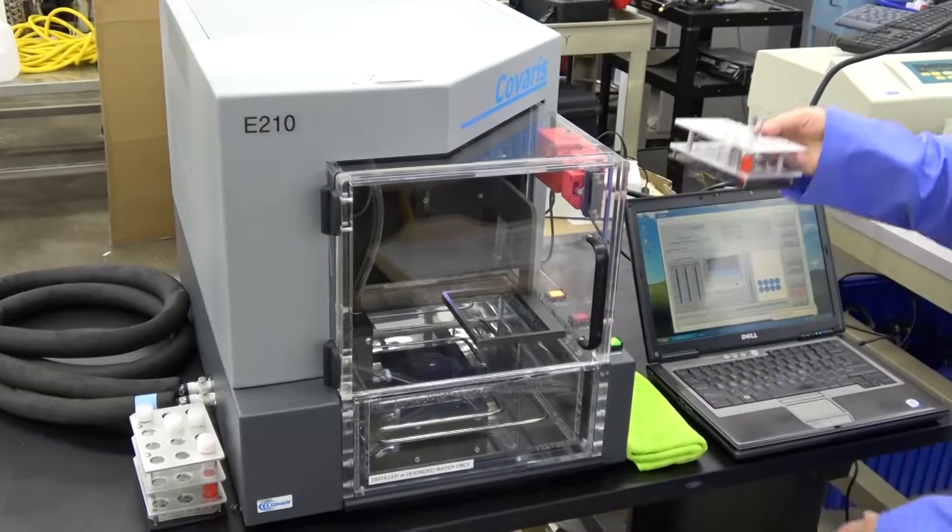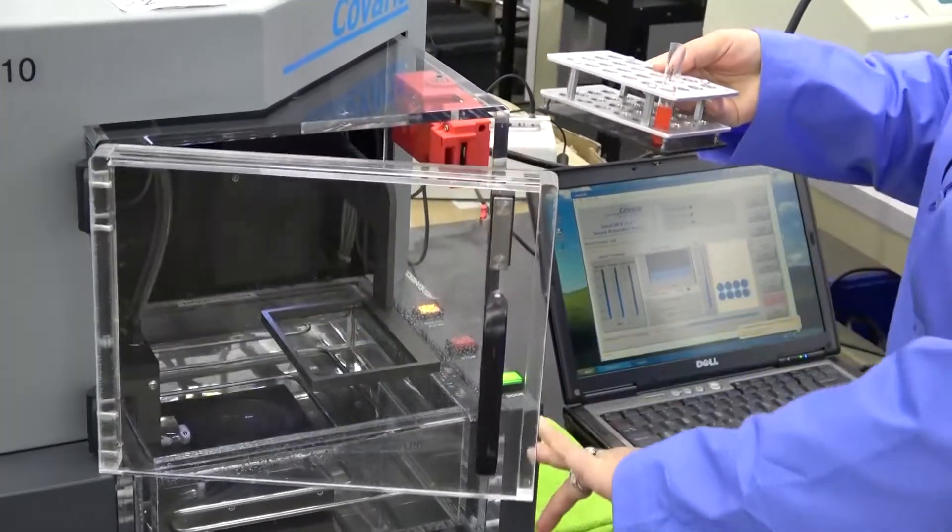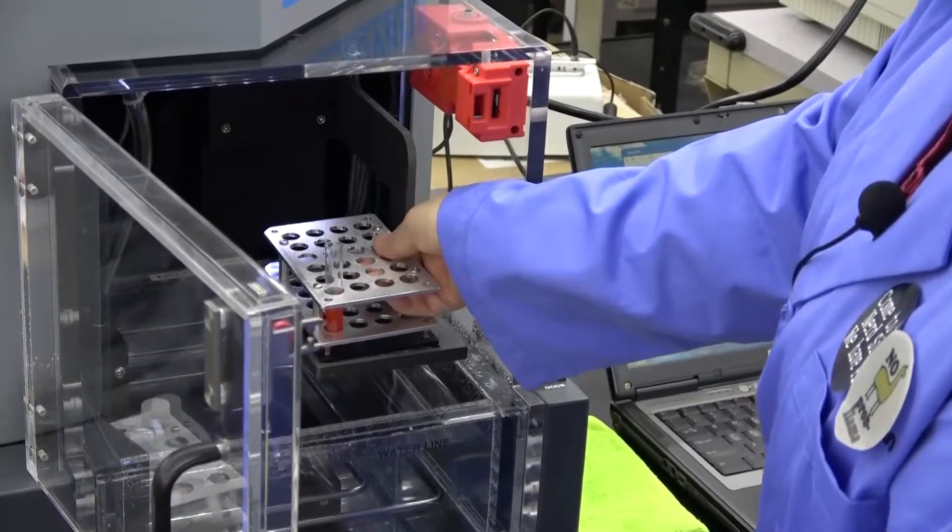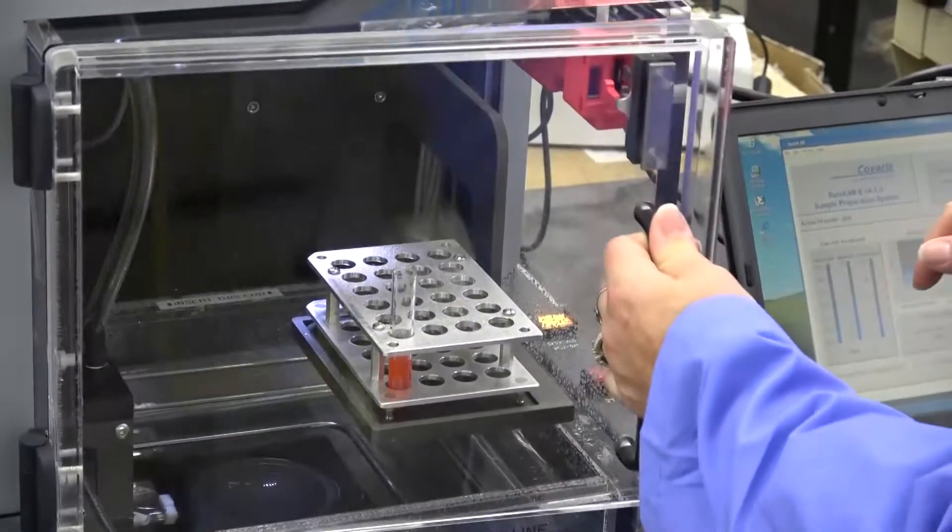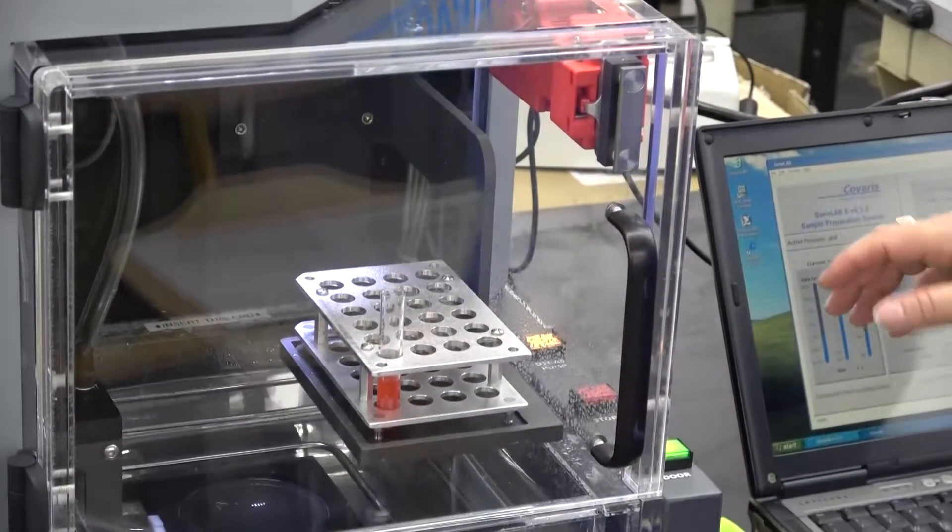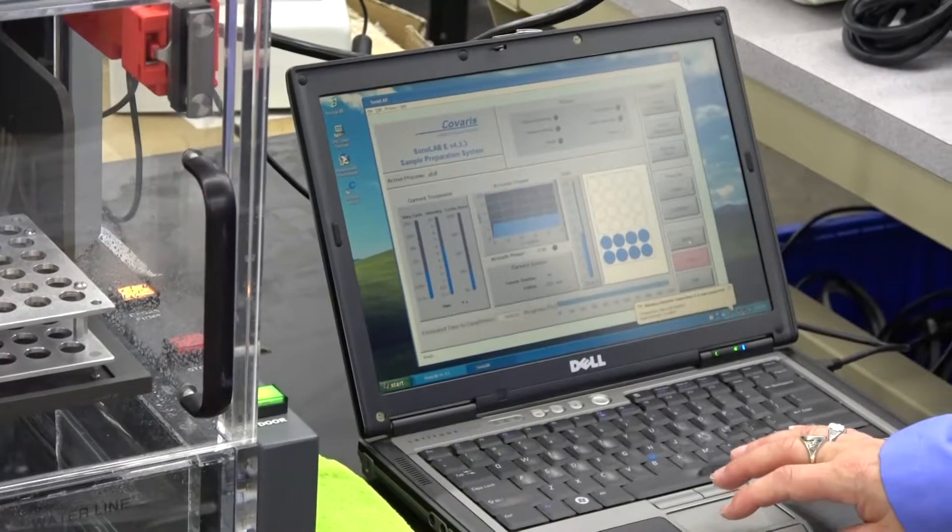We're going to go ahead and load a test tube rack with a small sample in it. Set it right in that holder. We will start up the method in the software.